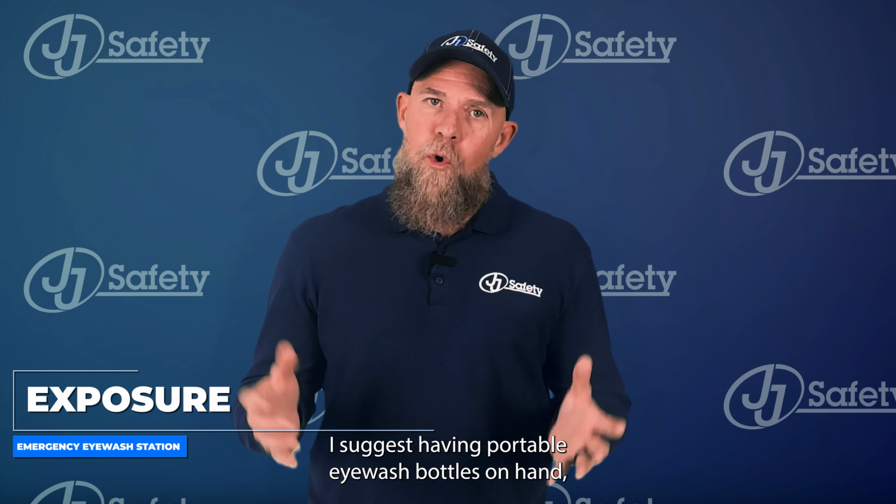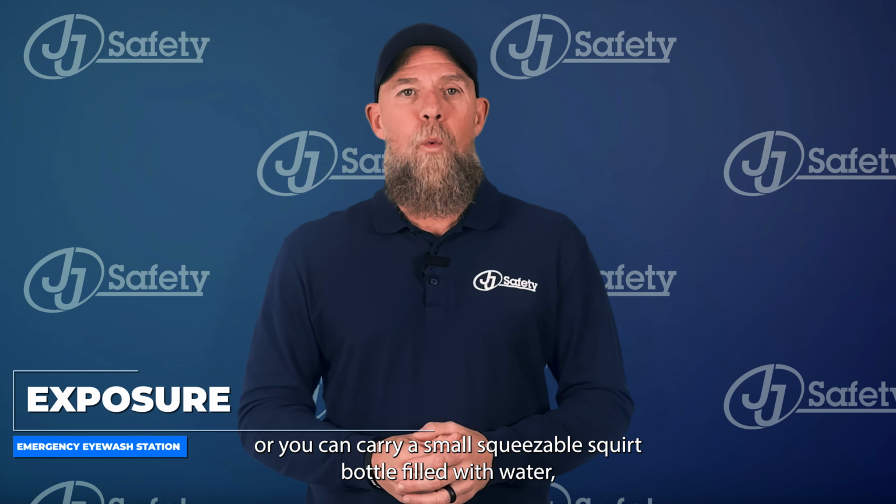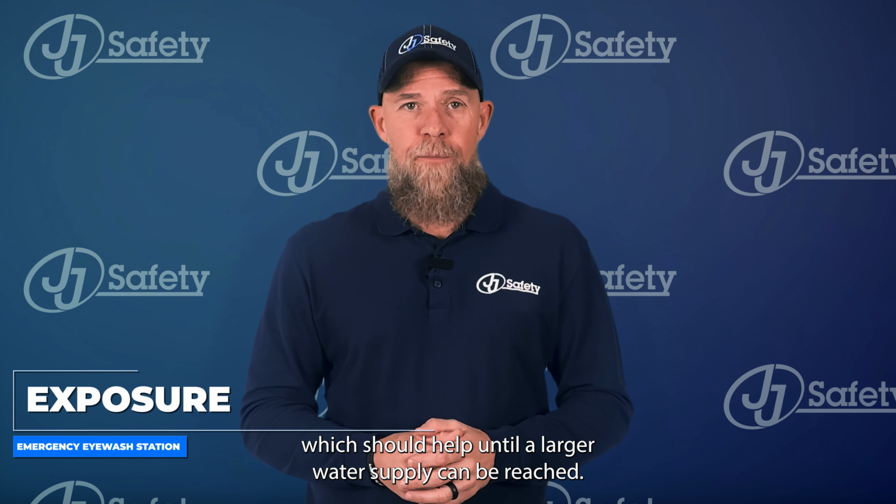I suggest having portable eyewash bottles on hand, or you can carry a small squeezable squirt bottle filled with water, which should help until a larger water supply can be reached.